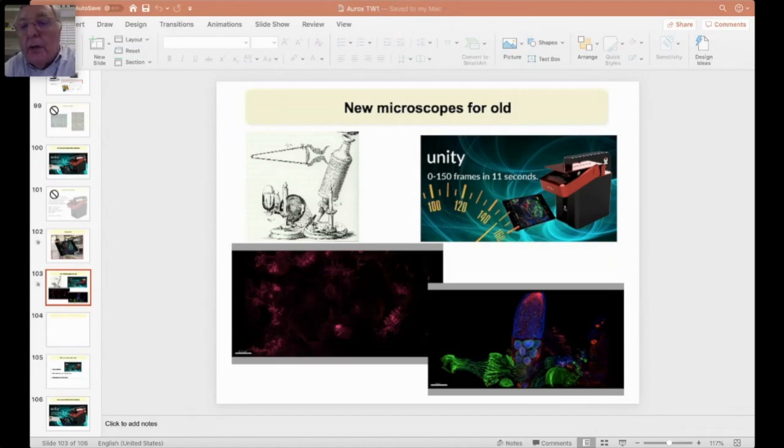We came up with the confocal, if you like, because we like mathematics. And if you stick a pinhole in the equation, it becomes a delta function, and the integral is easy. So we actually had a thing called a type 1 microscope, which was the regular scanning microscope, and a thing called a type 2, which was the scanning microscope with the pinhole, which of course is the confocal. But who came up with it, I don't honestly know.